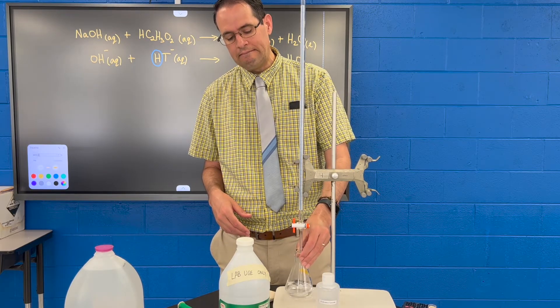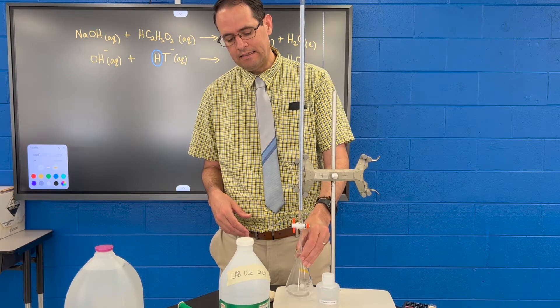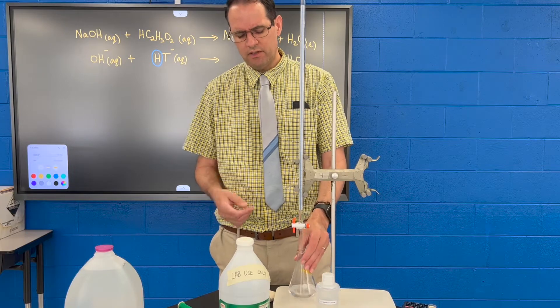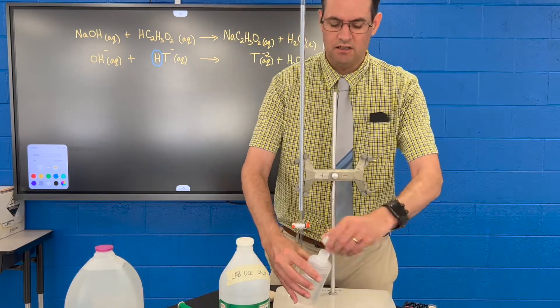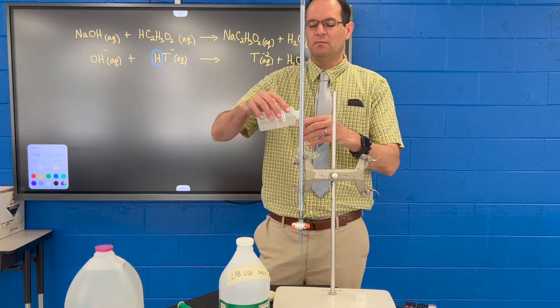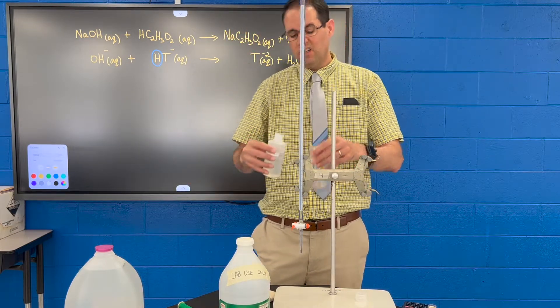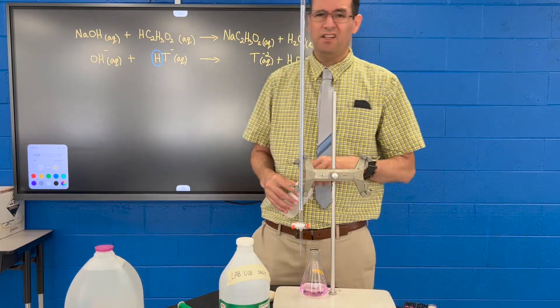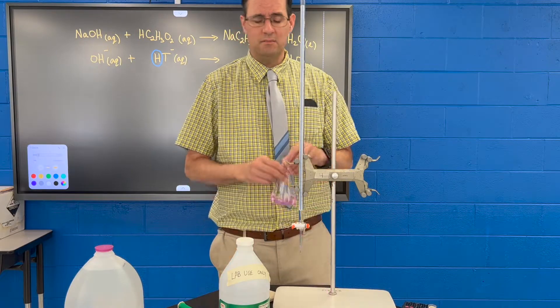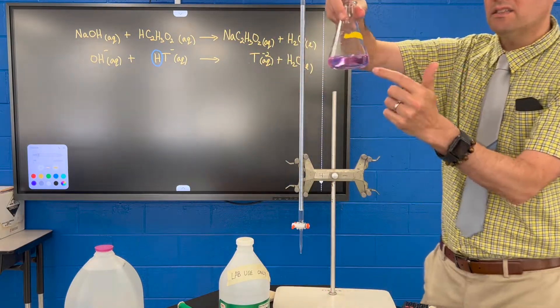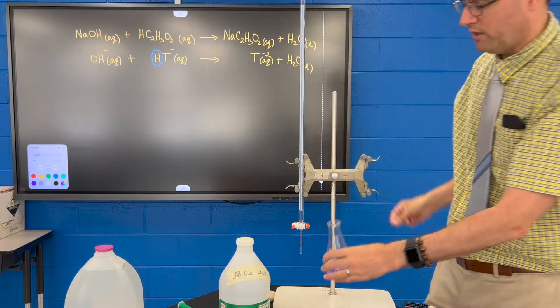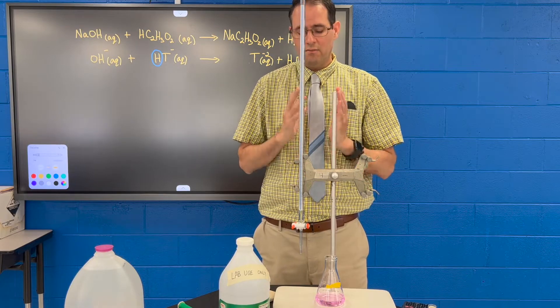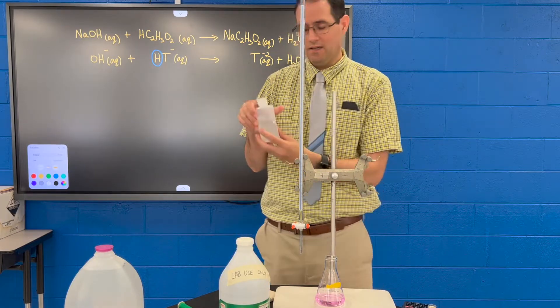And I think I'll need about 40 or so milliliters of this stuff, so I'm going to pretend like it changes pink. I'll just show you what it looks like at the end because we're not really critically worried about getting the data here. So you want to get to a very faint pink. And don't worry if you're watching the video demonstration - I stop when it's a faint pink. When it just turns pink, that means you've reached the equivalence point. The moles of vinegar are equal to the moles of sodium hydroxide.